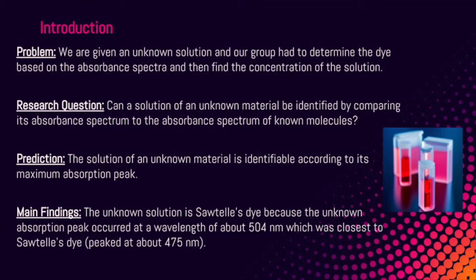Our group was given an unknown solution, and our task was to gather data for an absorbance spectra, which would then be used to determine what dye we were working with and the concentration of the dye in the solution.